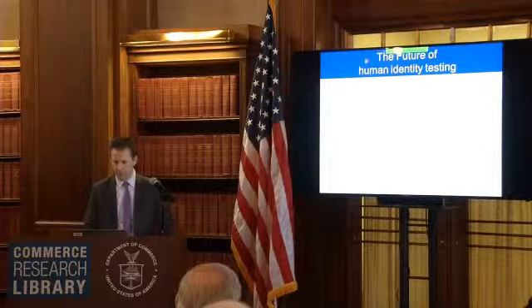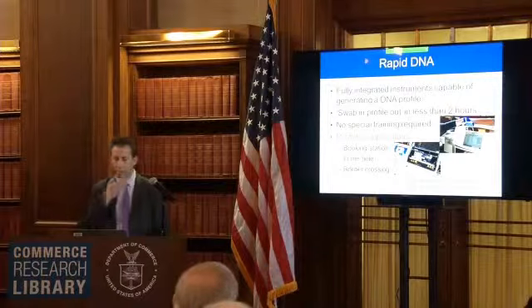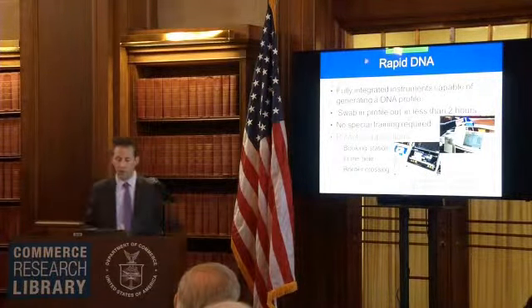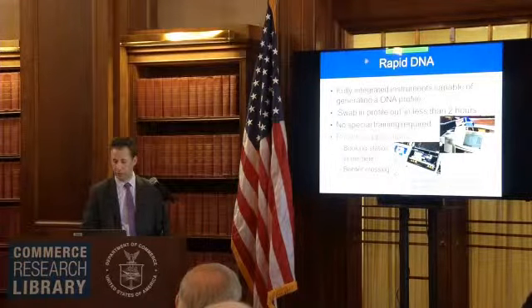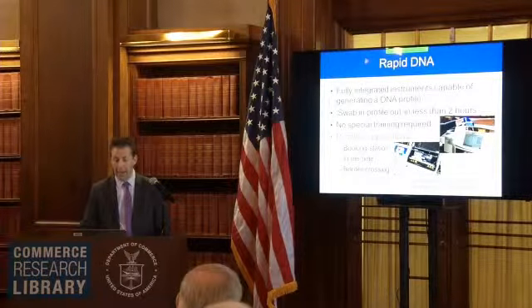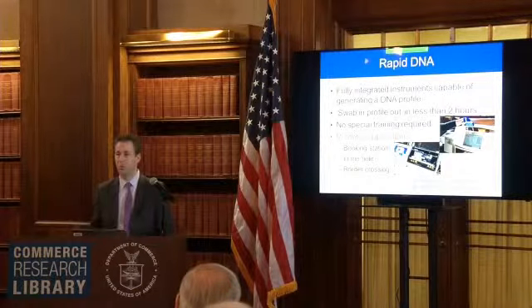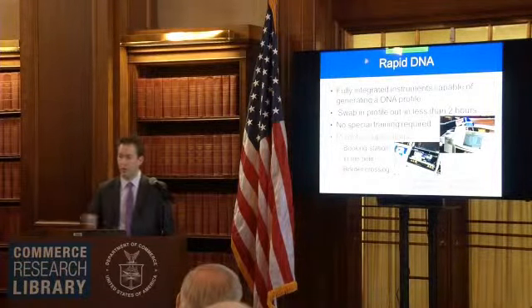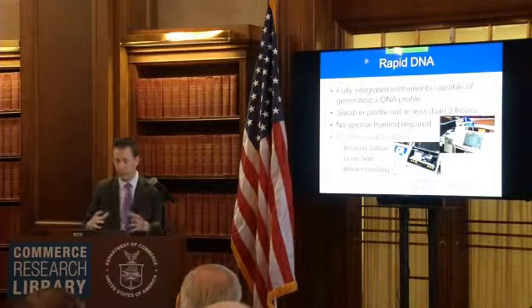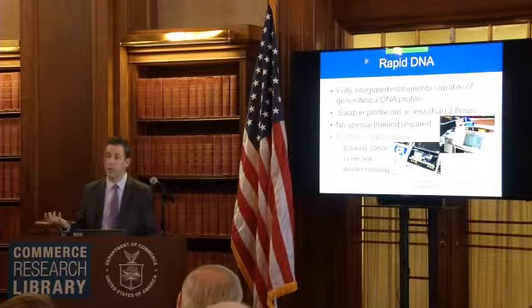I'll finish up here with some ideas on the future of human identity testing. One thing I talked about before was rapid DNA, and we've done some work with rapid PCR protocols. There are two companies listed here below, IntegenX and NetBio, that have these different instruments, and here's a picture of each. This is really a swab in, profile out in less than 2 hours with no special training. You could come up to someone, swab them, put it into this box, which has a consumable that can be thrown away after one run. You hit go, and in 2 hours it'll generate a profile that's been analyzed for you.